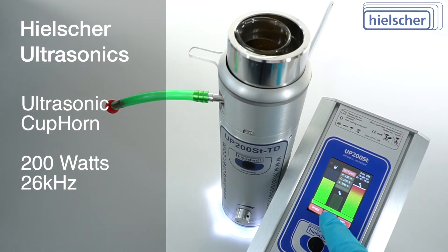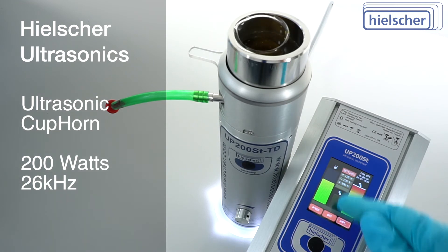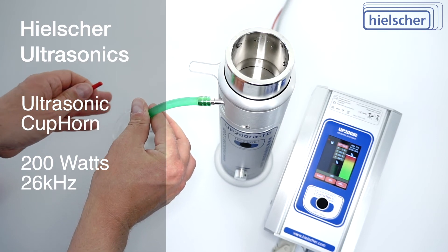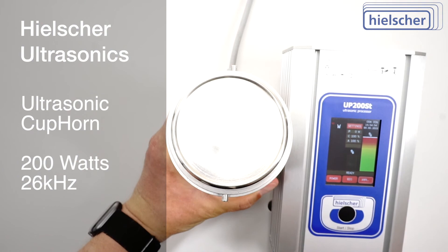The parameters and performance data are logged in real time for each sonication. The resulting CSV files can be opened with any spreadsheet program or as a text file. For convenient draining of the coupling fluid, the Cup Horn has a drain outlet. The innovative Quick Lock system allows easy disassembly for cleaning.